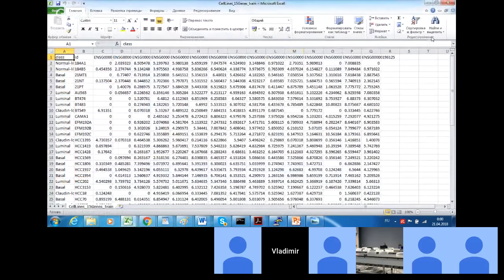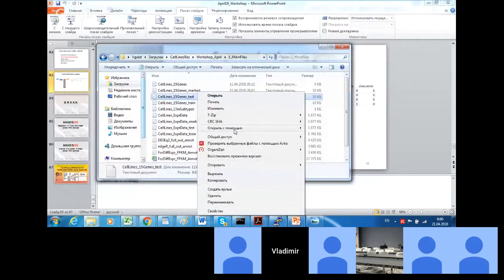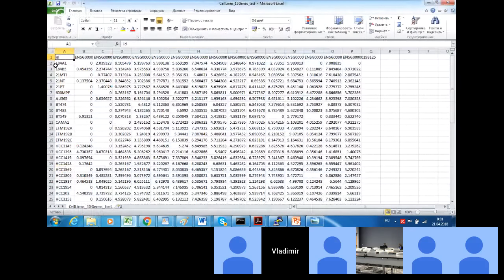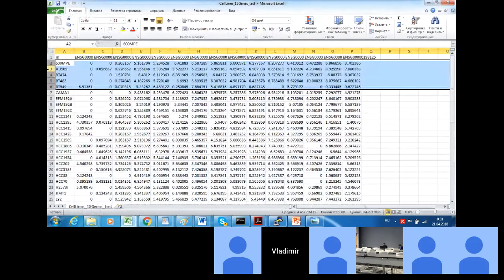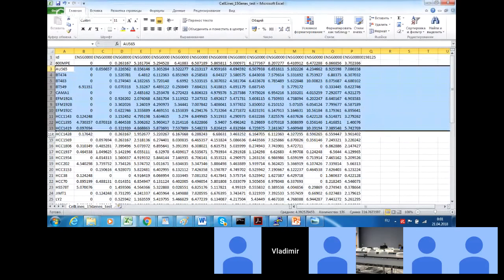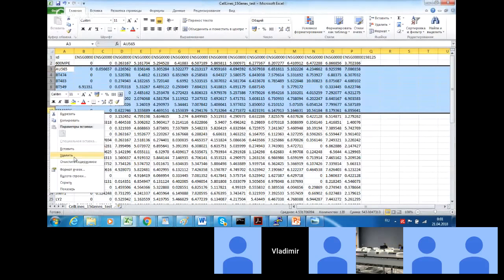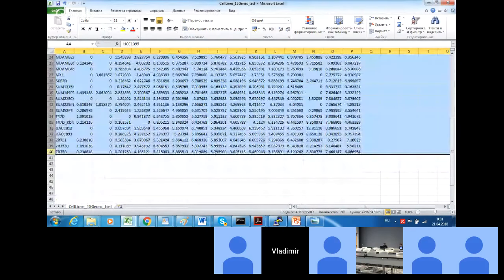There is no more information related to these samples, and let me take only these two samples as new ones. So in the set of new samples, I keep only the sample 600 MPE, and I keep the sample, I'm looking at it, here it is, HCC 1143.